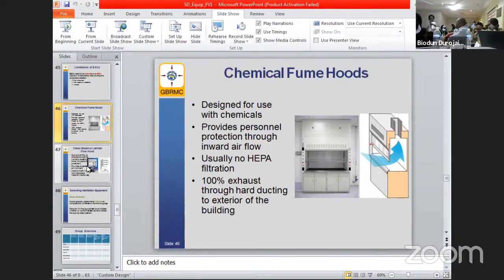How it is done depends on what you're working with. It depends on the environmental impact assessment, the outcome of that assessment. It will guide them on what to do about the chemical fumes that are going outside. Because they may also have some trapping outside that they will build beyond what is inside the establishment.